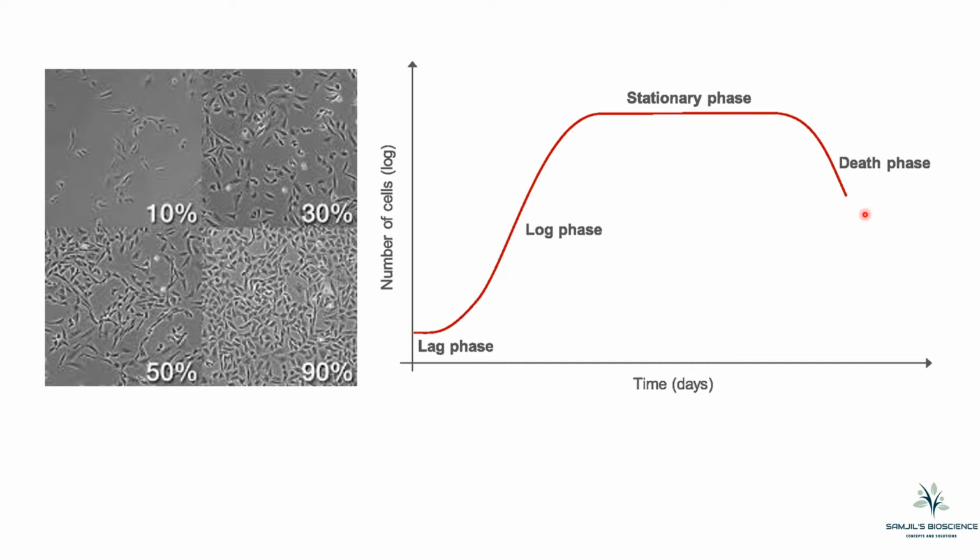So you always have to be cautious when dealing with cell lines that the cells are in the log phase, also known as the exponential phase, where they grow exponentially, and that's why you see this steep rise. This is the reason the cells need to be split. That is called subculturing, to maintain the genetic stability and the phenotypic status, and they remain viable.